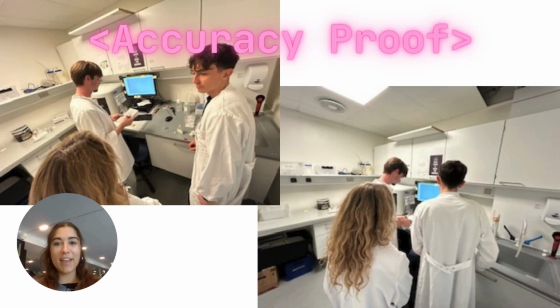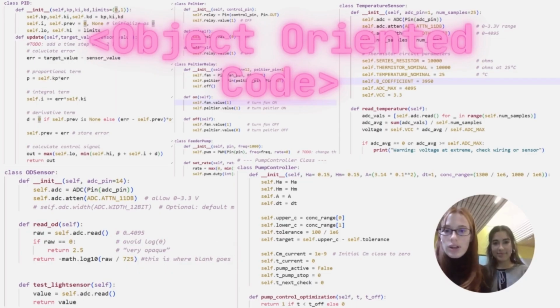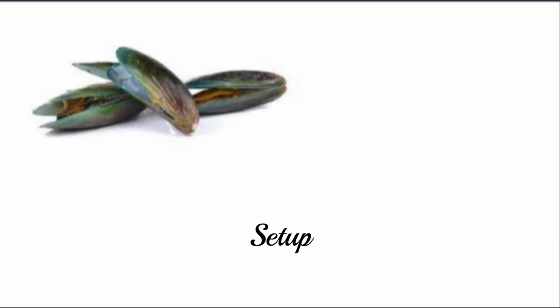Finally, we want to prove the accuracy of our model, which we did by taking a sample and measuring the OD value of it and obtaining the concentration from that, which we then compared to the concentration value we received from the lab using the particle counter. This confirmed the accuracy of the whole setup. We also made sure to write our code in an object-oriented manner.